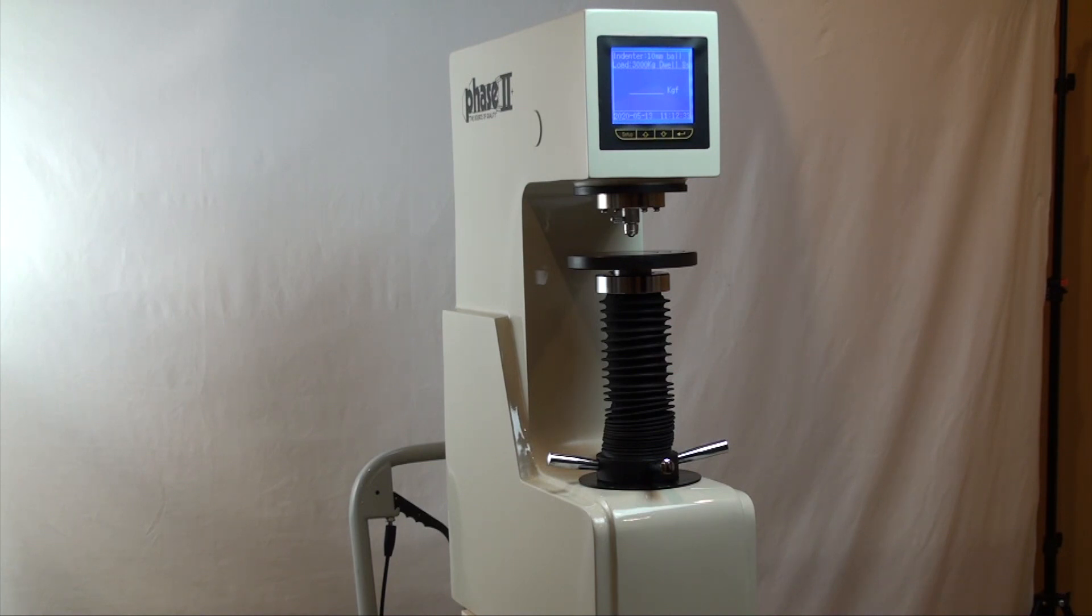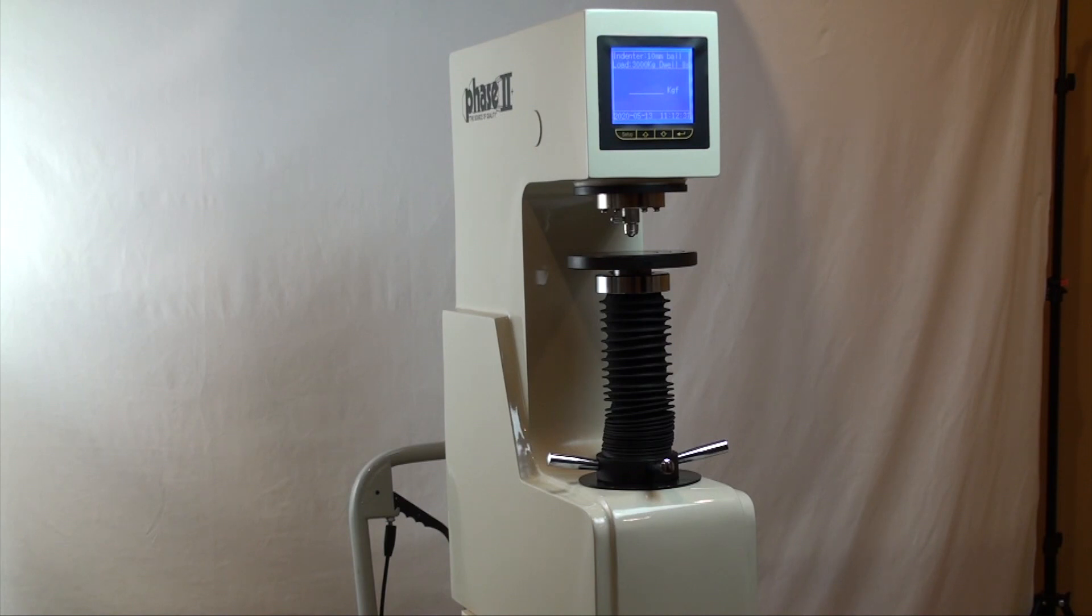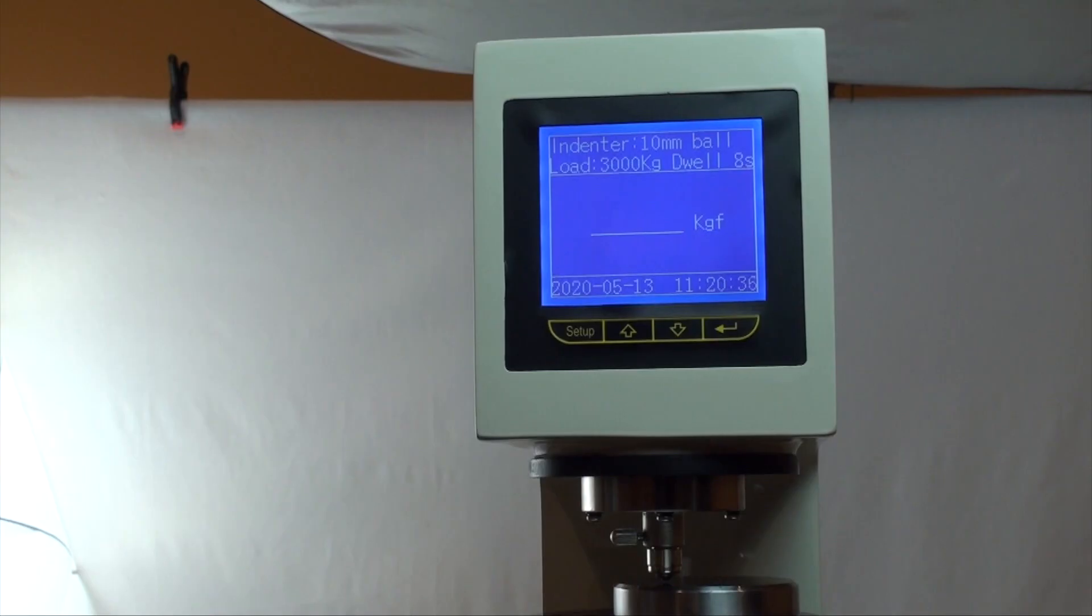Here we have the main interface screen which can input parameters and settings, and the manual microscope that is standard with this model, though a digital model can be purchased as an option separately.